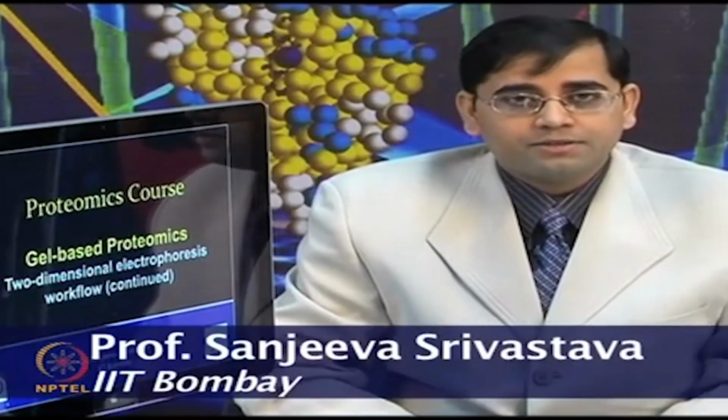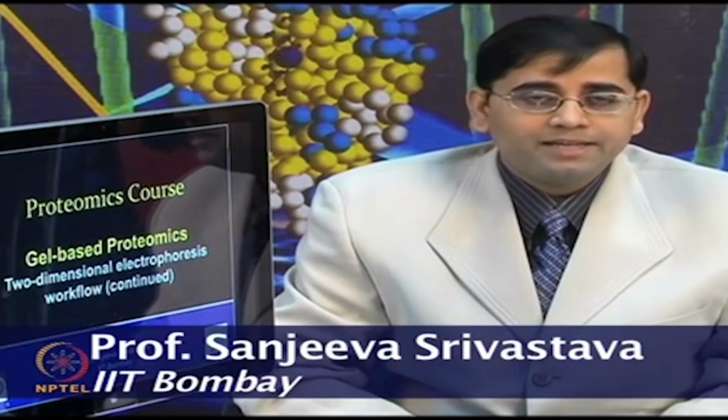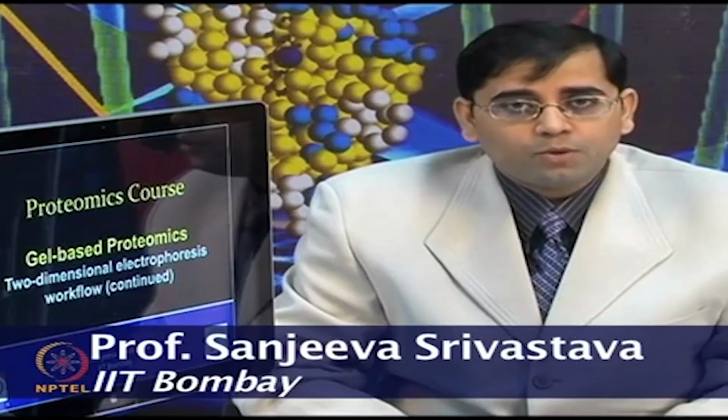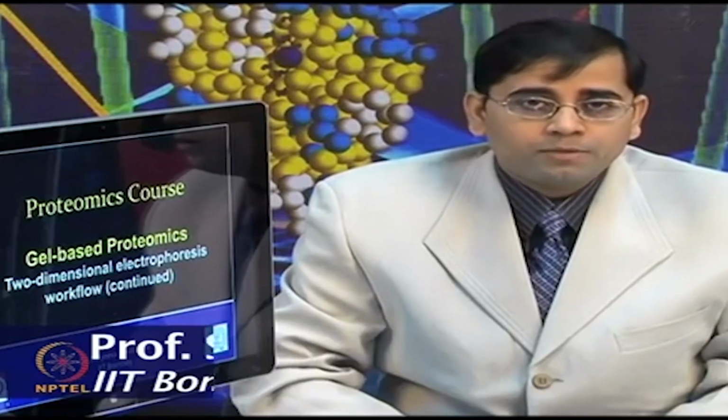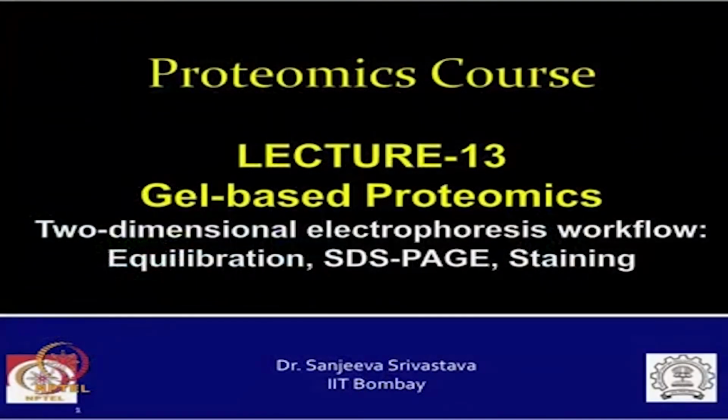In the previous lecture, we started discussing gel-based proteomics. In that workflow, we talked about two-dimensional gel electrophoresis, and there are different steps involved in performing it.